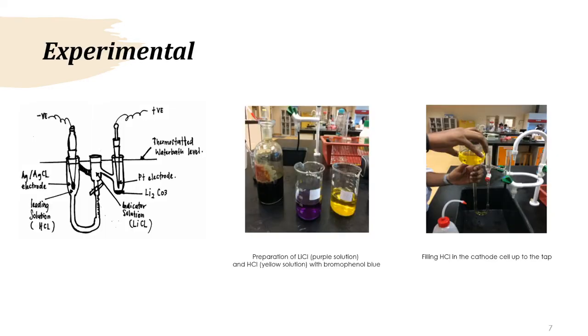So this is what I meant. Here you have the cartoon drawing of the electrolysis cell. You have here where you put the leading solution. First, of course, you have to really rinse the cell well. And this is what I meant, that this is actually made by our glass blower.